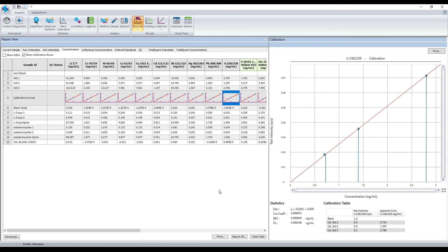In order to make the next in the series even easier to use, the software comes preloaded with a number of analytical methods to cover a wide range of applications, including environmental, biomonitoring, food, pharmaceutical, and semiconductor.